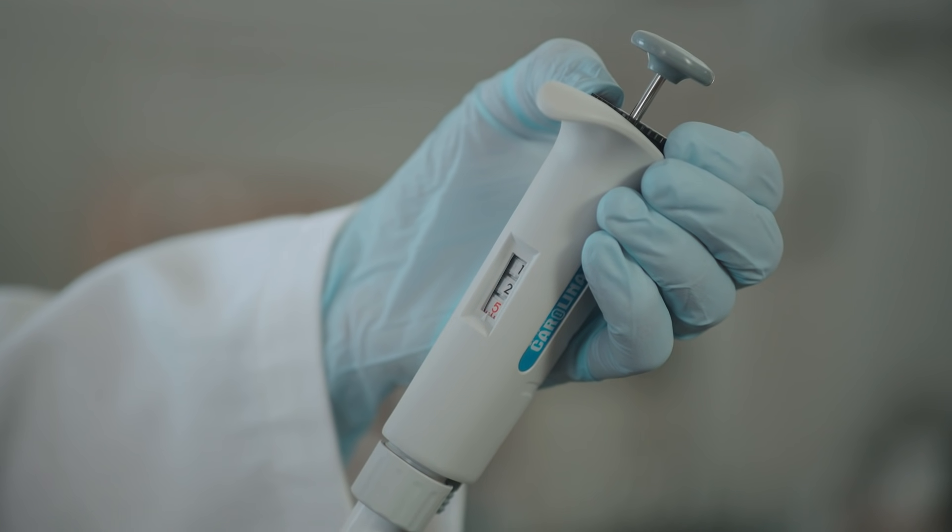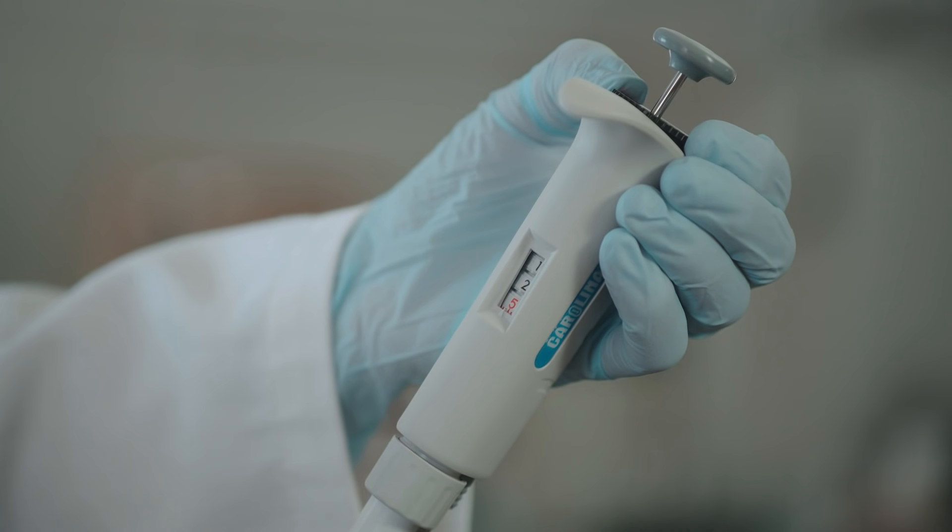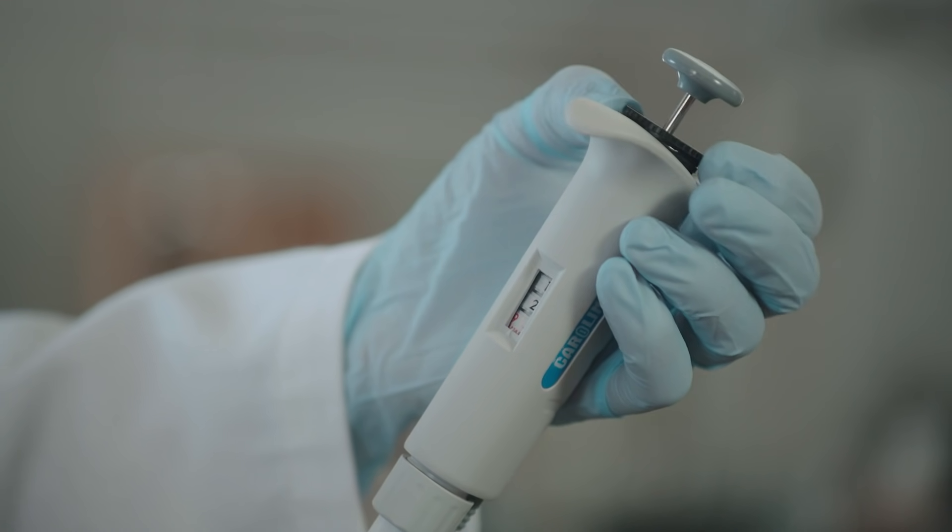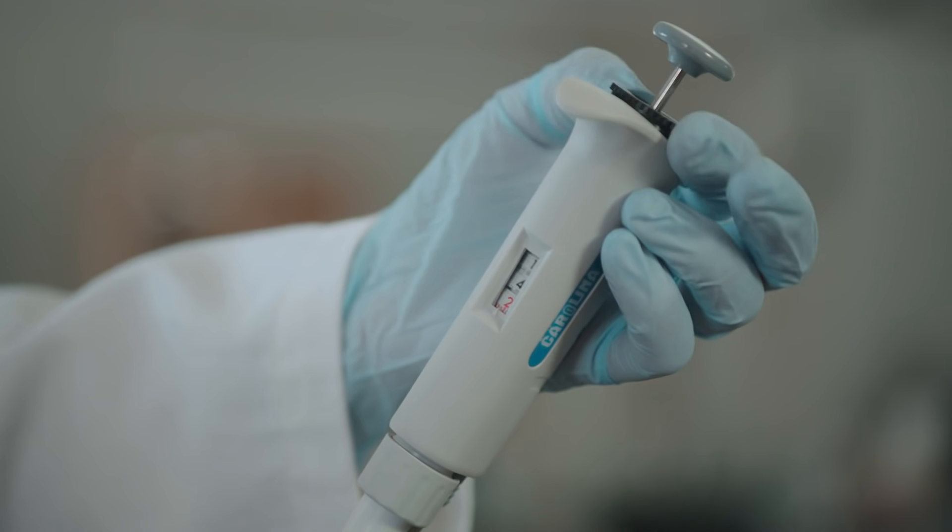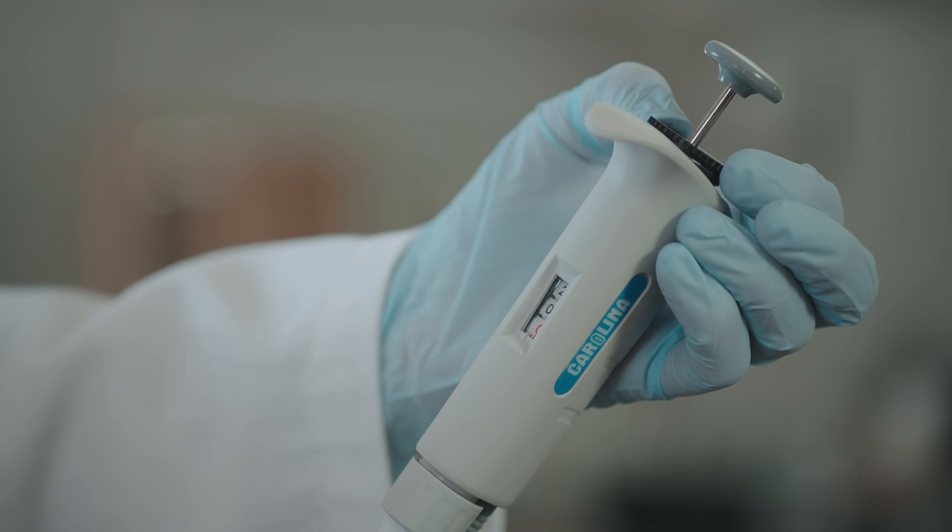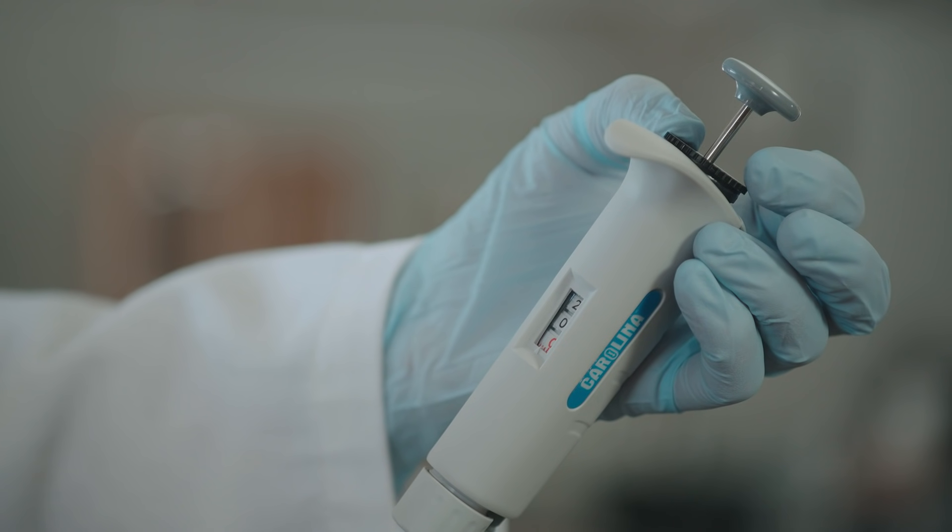Different micro pipettes have different but similar mechanisms for setting the volume they will take up. To set the volume on this P20, gently pull up and turn the black wheel as shown here. This pipette has now been set to 20 microliters.